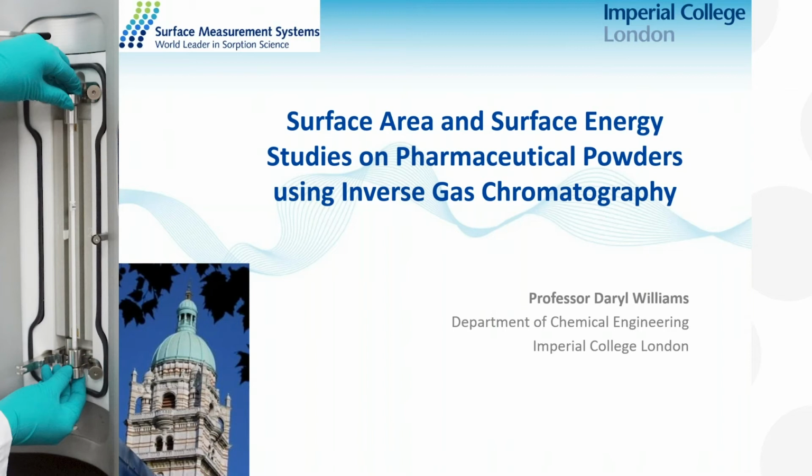A related technique to dynamic vapor sorption is inverse gas chromatography, and I'll spend a little bit of time explaining that, and then I'll give you some examples of the sort of information sets that you can obtain by characterizing pharmaceutical powders using inverse gas chromatography. Our emphasis today will be on both surface area, which we heard a little bit about before, and also surface energy, which are two important powder attributes, and not always attributes that are commonly measured.